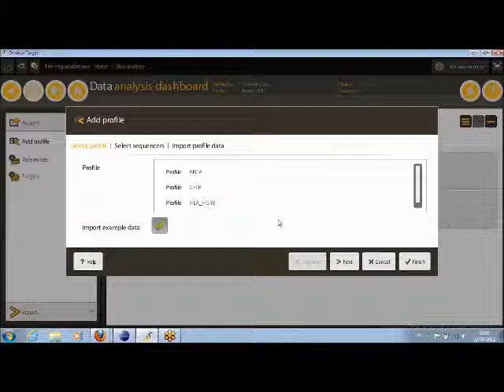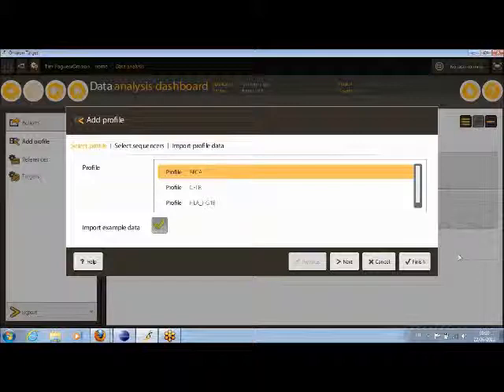One of the things that we have within this part of the tool, and the reason why the tool is called Omixon Target, is this concept of a target. We're going to have a look at that a little bit later. So the profile basically contains reference data and a target definition. But I'll just import one now so you can see this working.